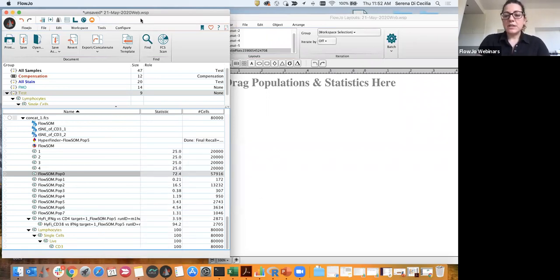Yes, the webinars are available. The webinars are available on the FlowJo Exchange under recorded webinars, and you find the title of the webinar and the date. So I'm gonna just show you how to concatenate again.